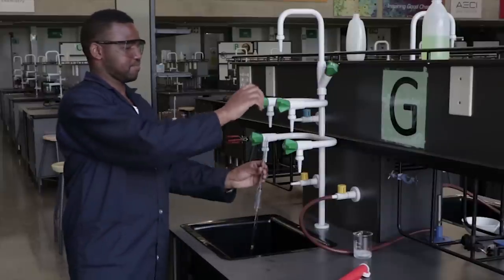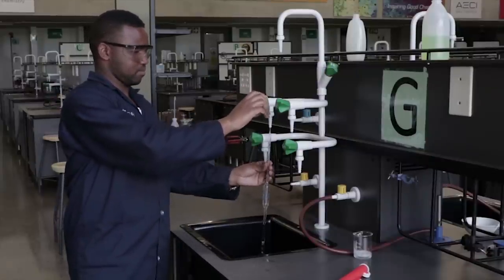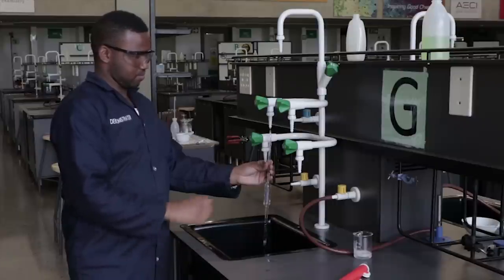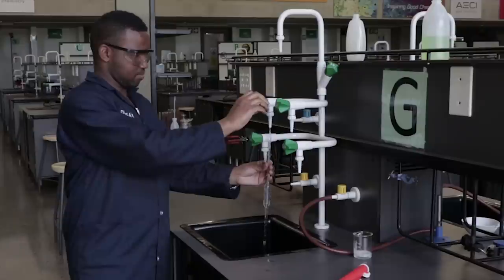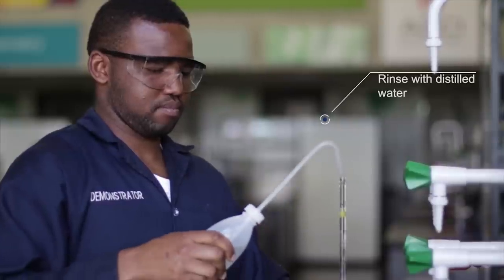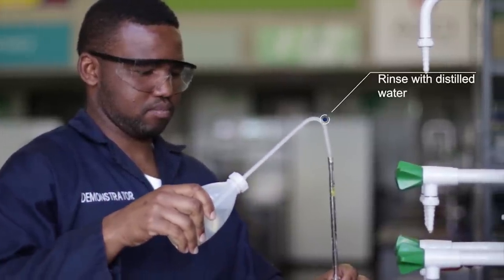The pipette is then inverted and the tip is held under a gentle running tap. This process is done for about a minute and the pipette is considered clean when the water droplets do not stick to the inner surface of the pipette. At this point, the pipette is rinsed with distilled water from the washing bottle to remove any remaining tap water.